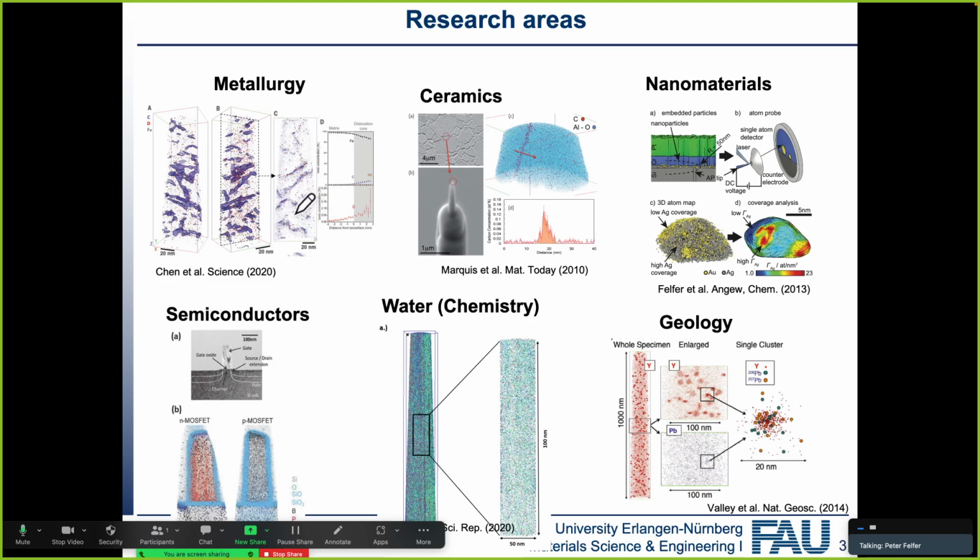It's laser pulsing, yes, this is voltage, but we can do laser. Ceramics is laser only. There's no way you can do ceramics without a laser, because in this case electrical conductivity is very low.